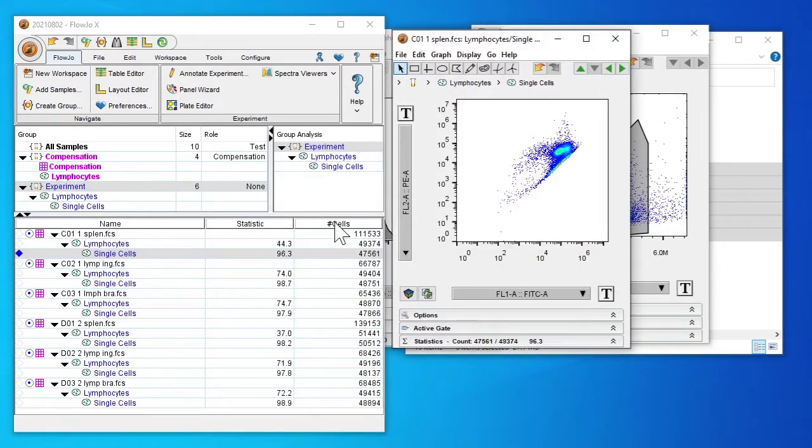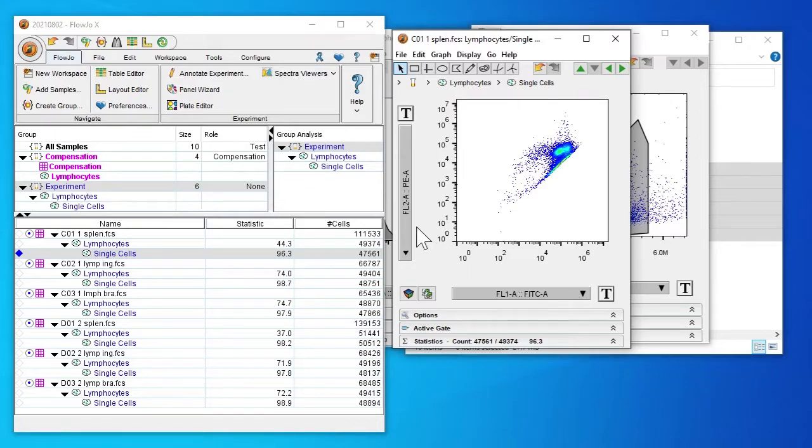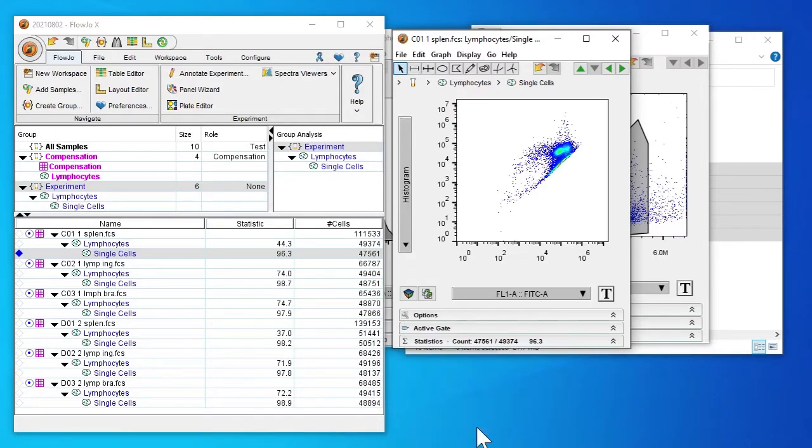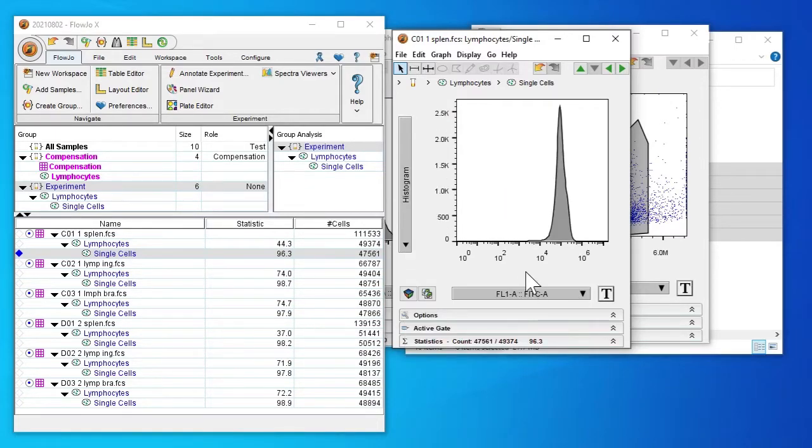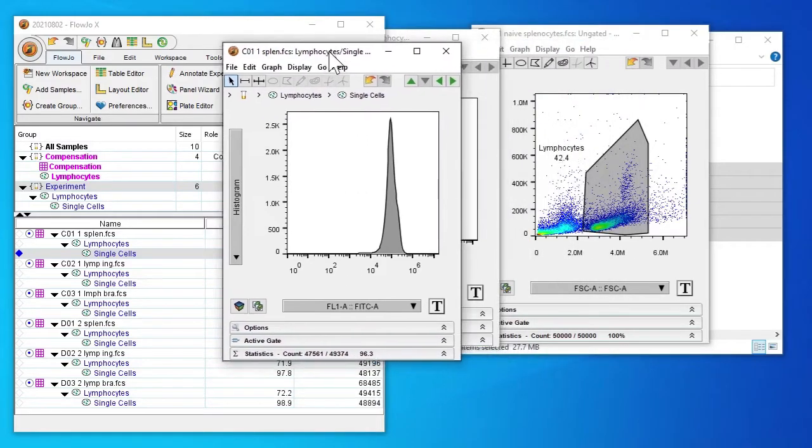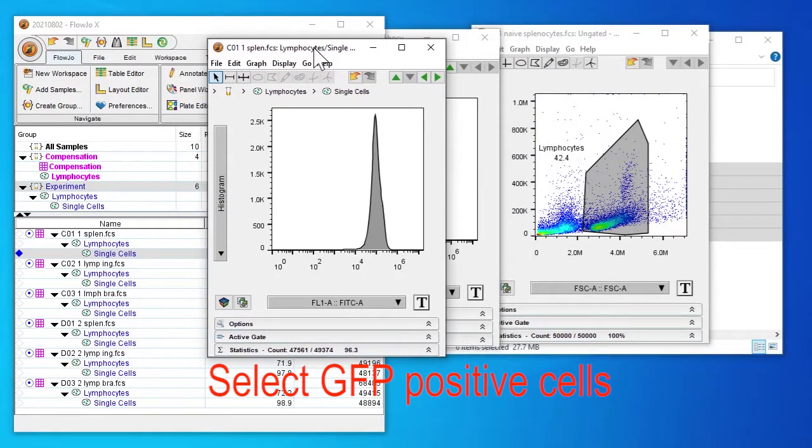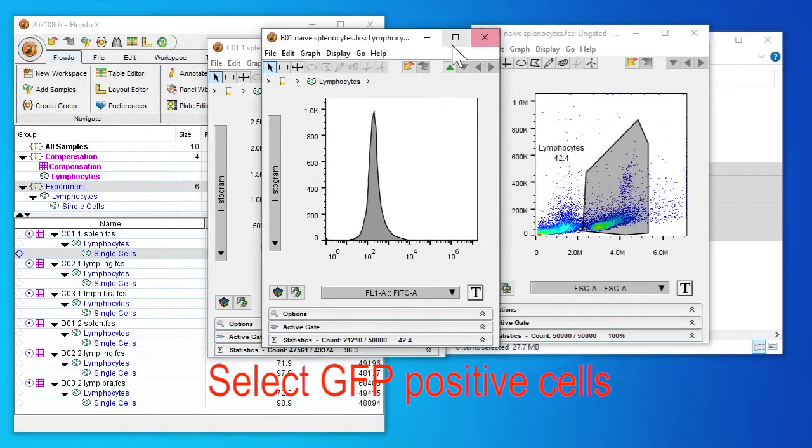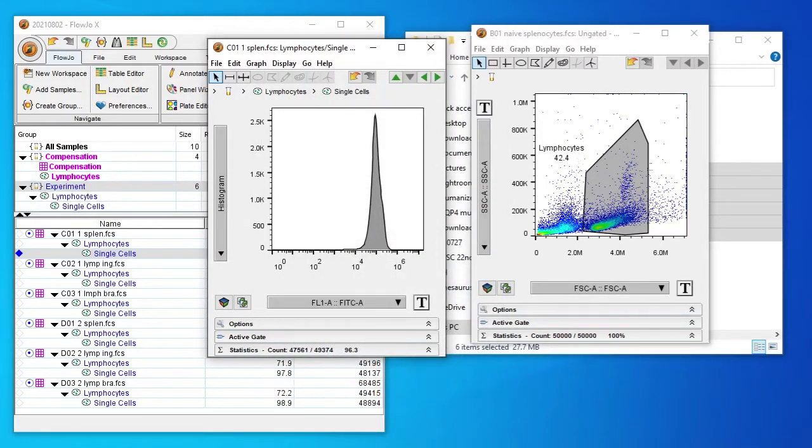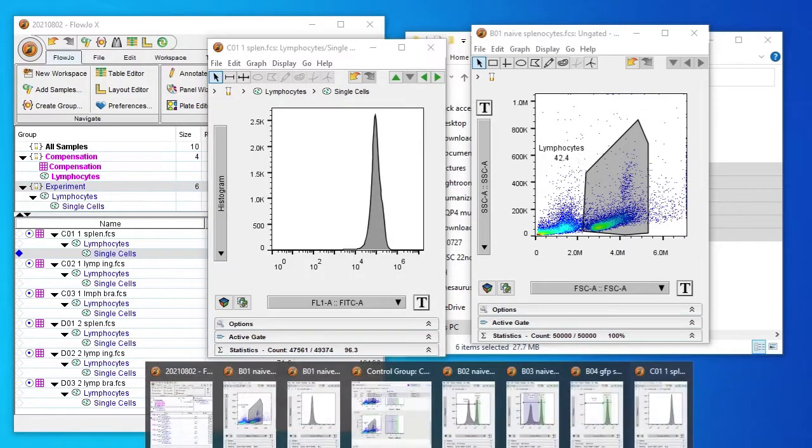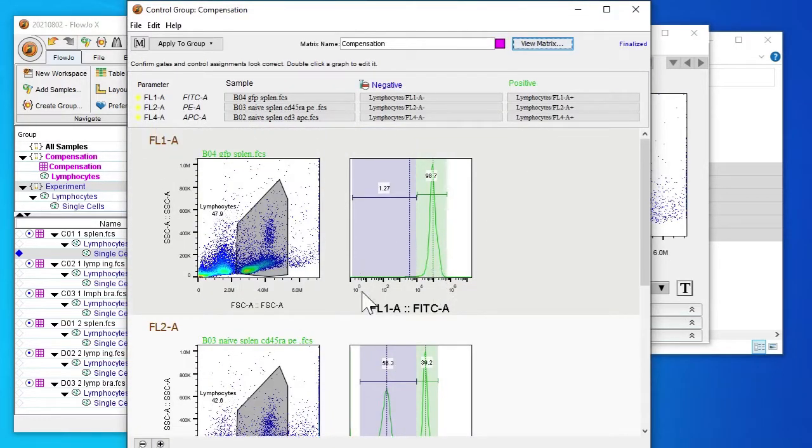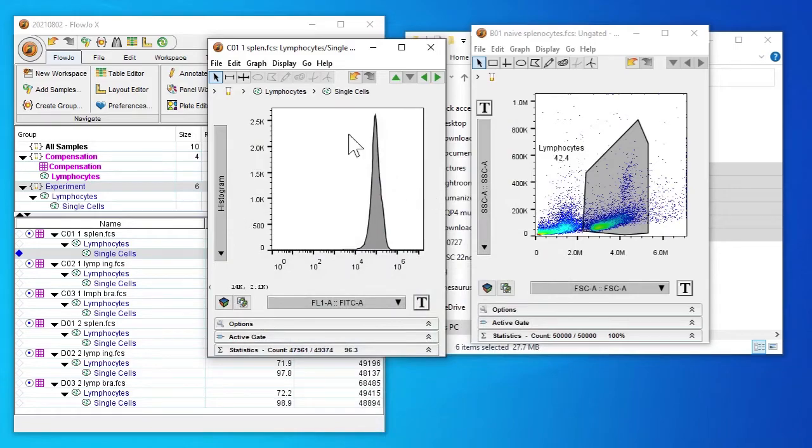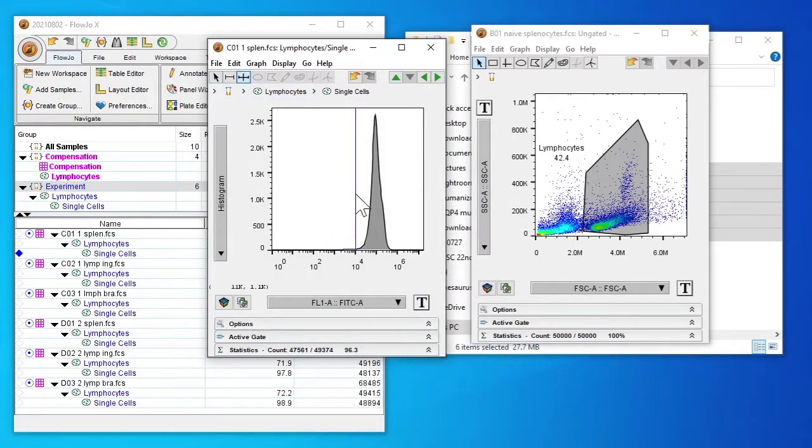Double click on single cells for our first sample and we want to look at GFP positive cells in this particular case. So you can see from our compensation we've selected the point 10 to the power of 4 as our cutoff so I'm going to do the same here.